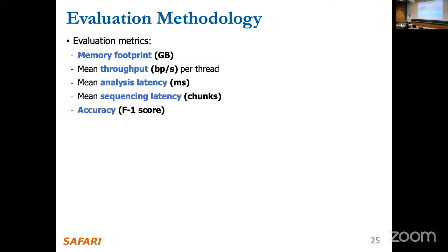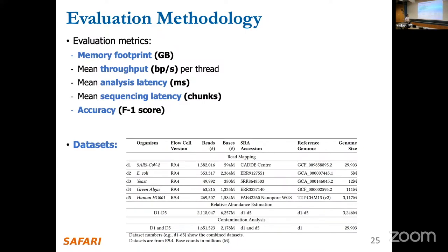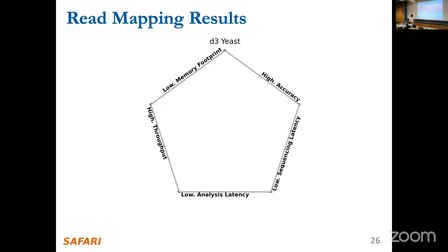And then finally, we have accuracy, of course, which is kind of obvious that you need to analyze it. We have analyzed on a bunch of data sets, across a variety of genomes. I mentioned earlier COVID, which is the smallest of our examples. By the way, the genome size is 29,900 base pairs apparently. And the largest one we analyzed is the human genome. Then you have a bunch of mixed data sets to evaluate metagenomic use cases, which is the methodology used in RawHash.